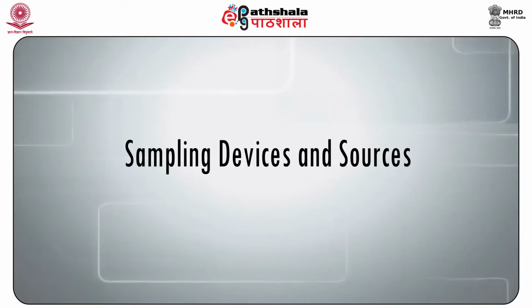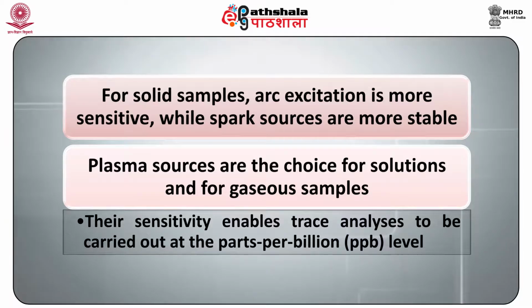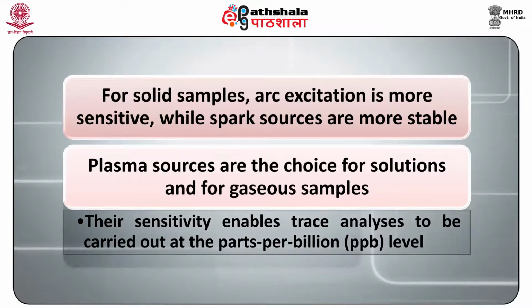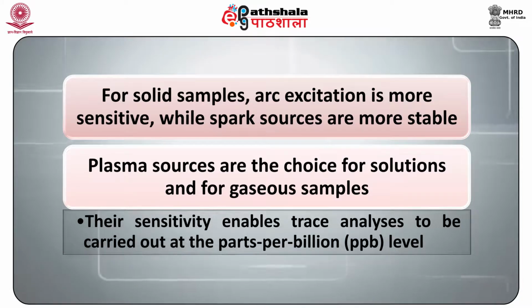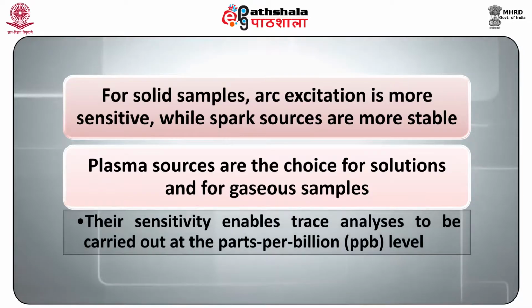Sampling device and sources. No single source is best for all applications. In general, for solid samples, arc excitation is most sensitive, while spark sources are more stable. Plasma sources are the choice for solution and for gaseous samples. The sensitivity enables trace analysis to be carried out at the parts per billion level.